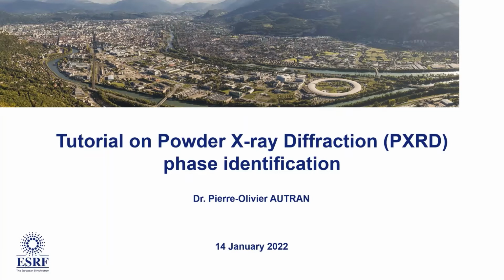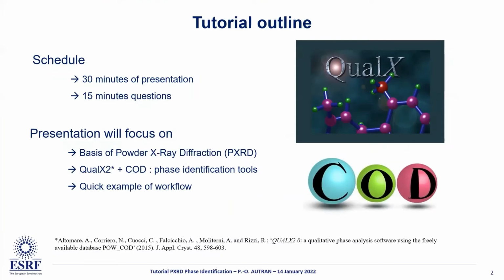a little bit of a tutorial on powder diffraction phase identification. The presentation is going to be around 30 minutes, with 15 to 30 minutes of questions, depending on if you have questions. Basically, I'm going to do a quick reminder on the basis of powder X-ray diffraction.